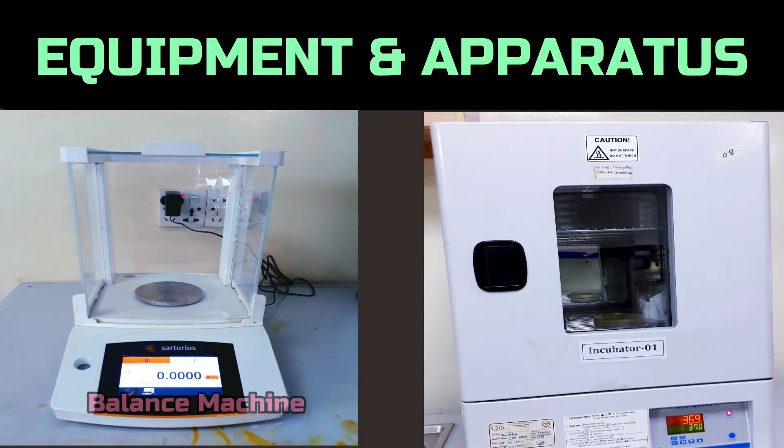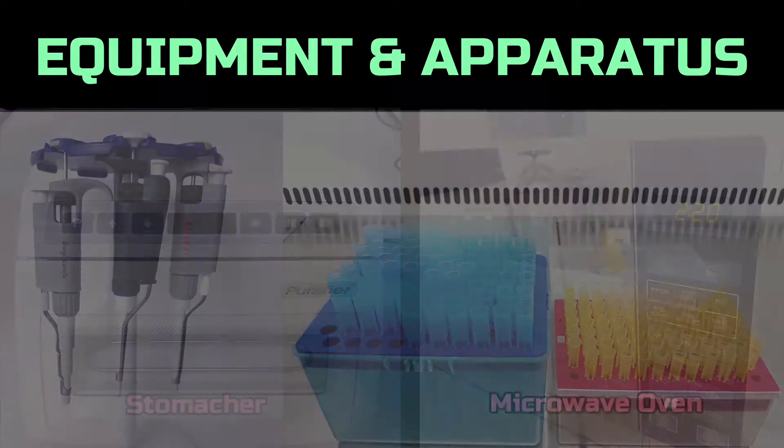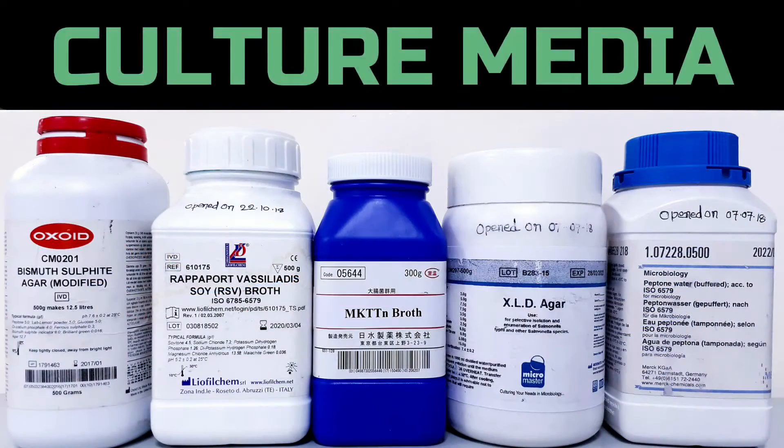For the isolation, we need a balance, incubator, biosafety cabinet, autoclave, stomacher, microwave oven, micropipette with tips, burner, stomacher bag, vortex mixer, sterile petri plates, bismuth sulphite agar, RVS and MKTTn broth, xylose lysine deoxycholate agar, and buffered peptone water.